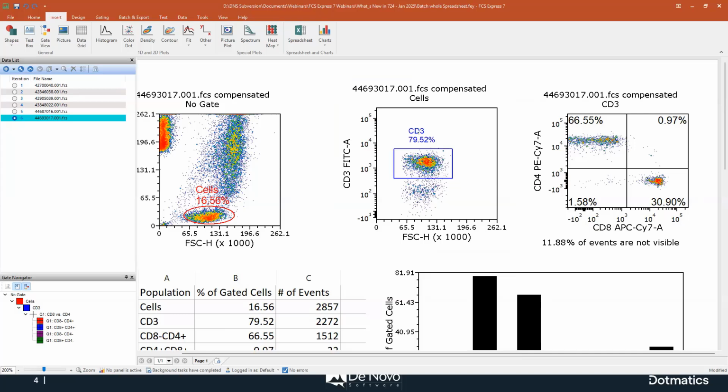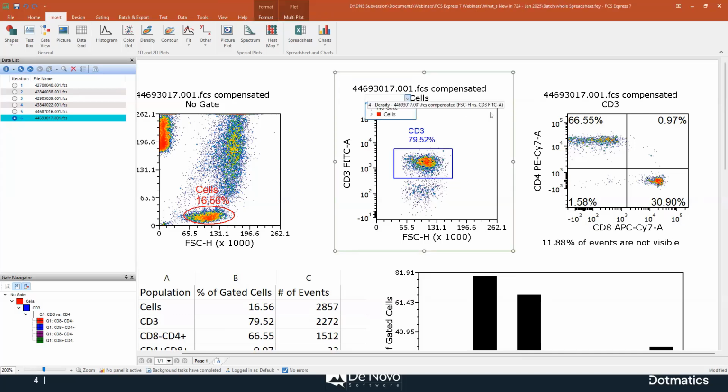The only crucial point is that you should just select the plot itself. So there is a sort of safety block. So if you select, for example, a text box, the plot won't be deleted, okay? If you select a specific object like a gate, the plot won't be deleted, the gate will be deleted.